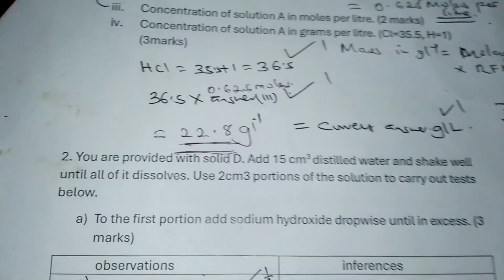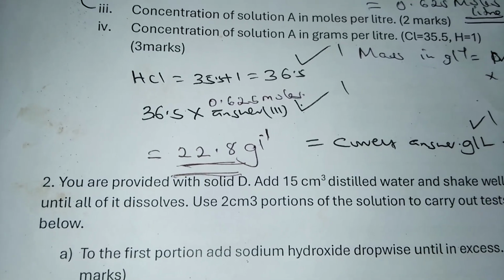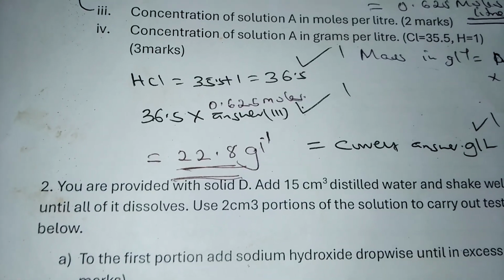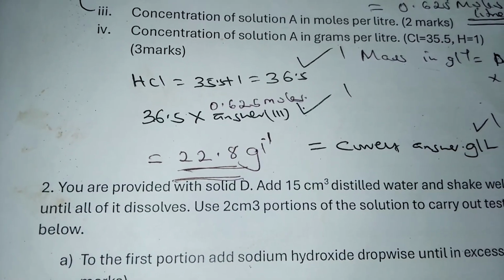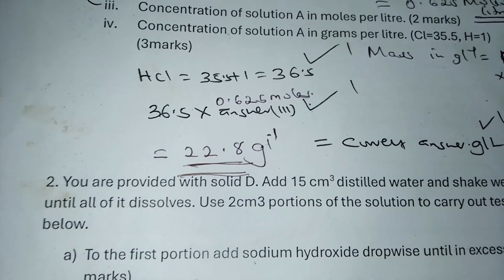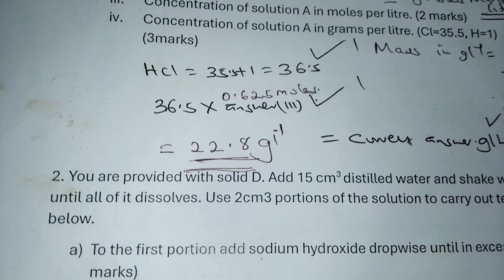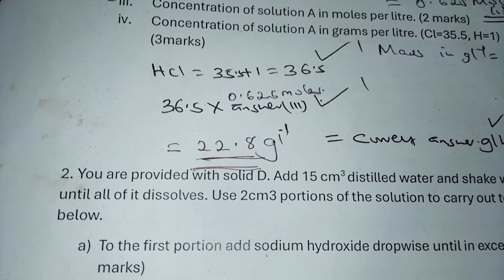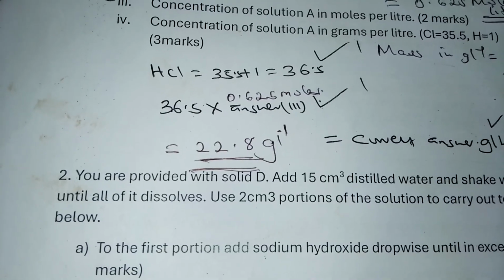We got the relative formula mass of hydrochloric acid, 35.5 plus 1, which gives a total of 36.5.